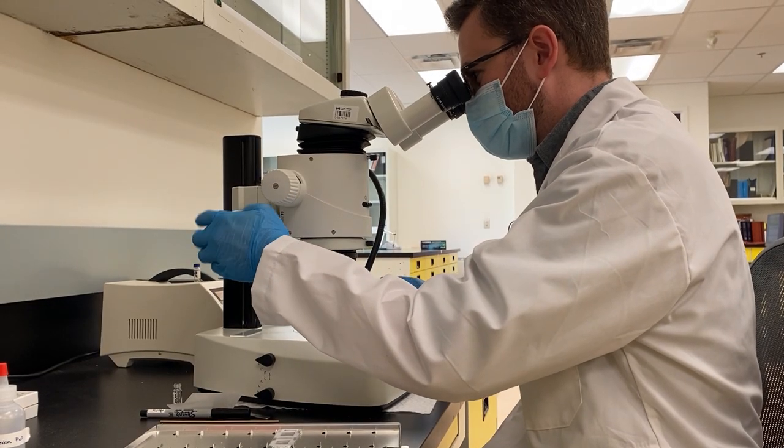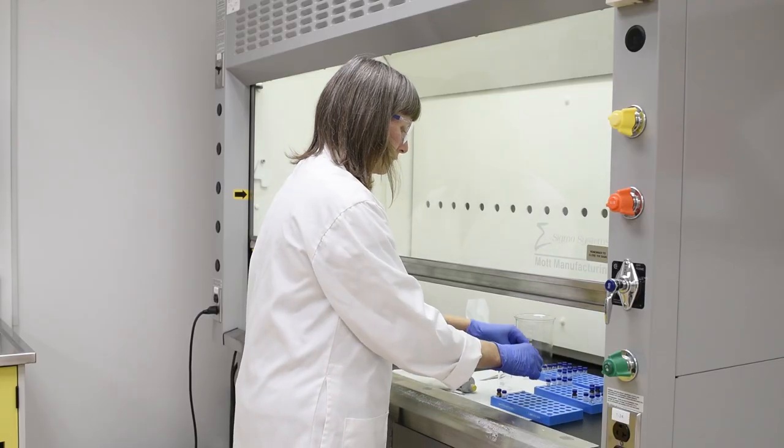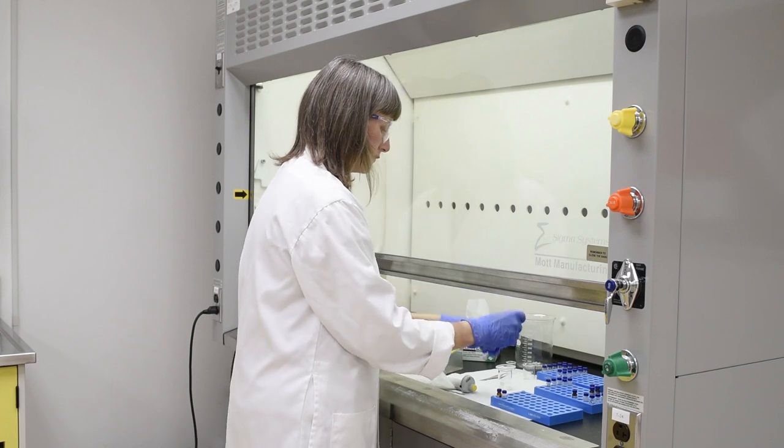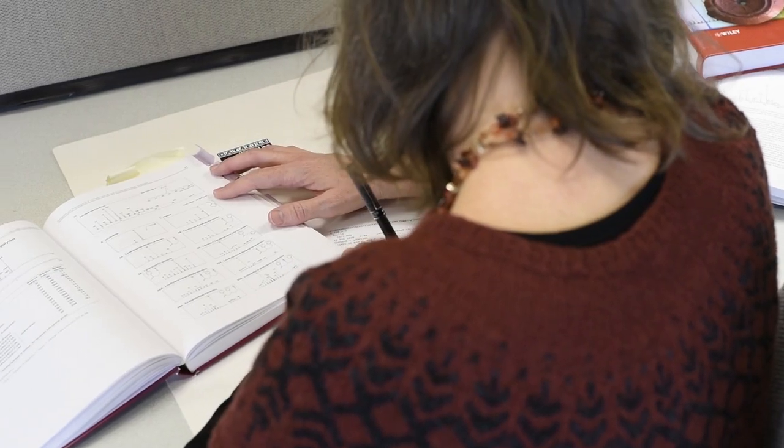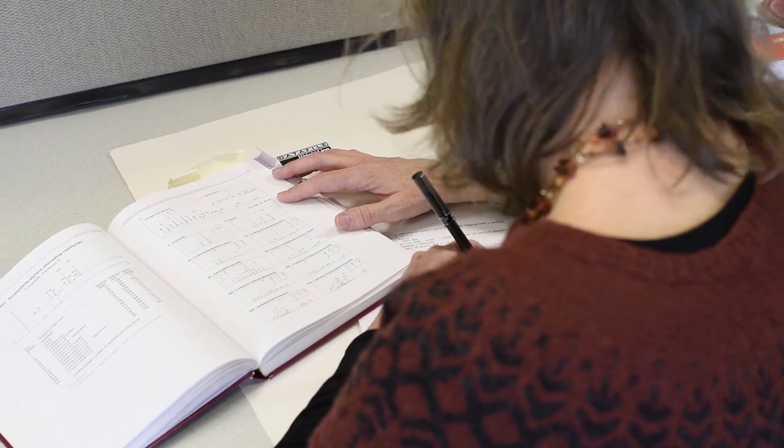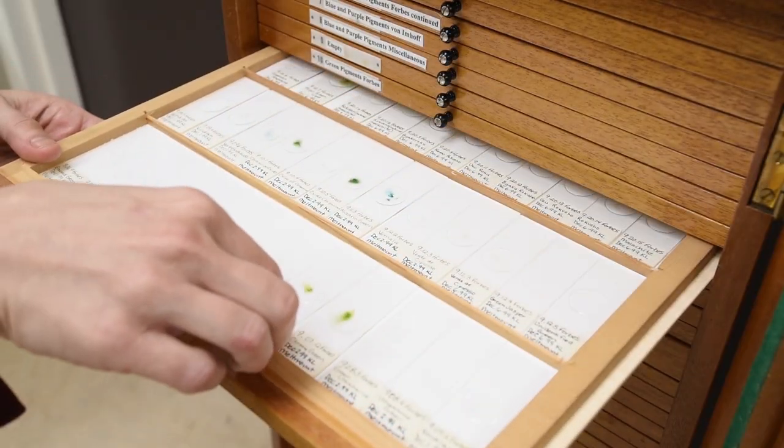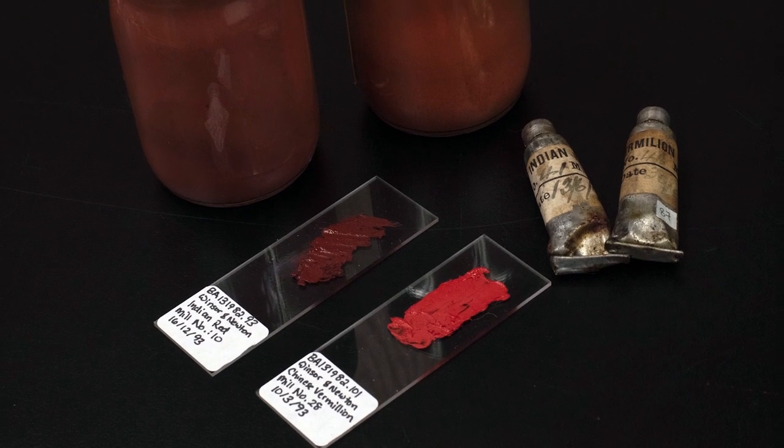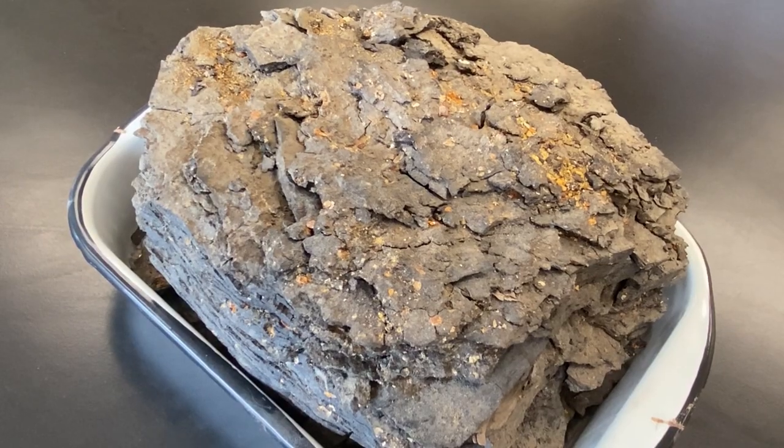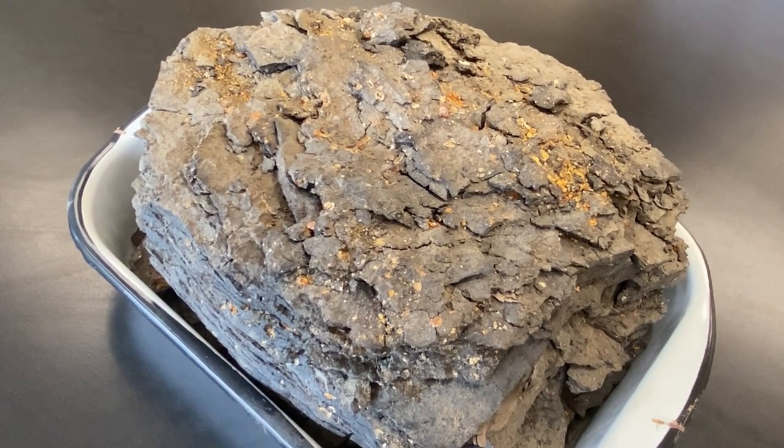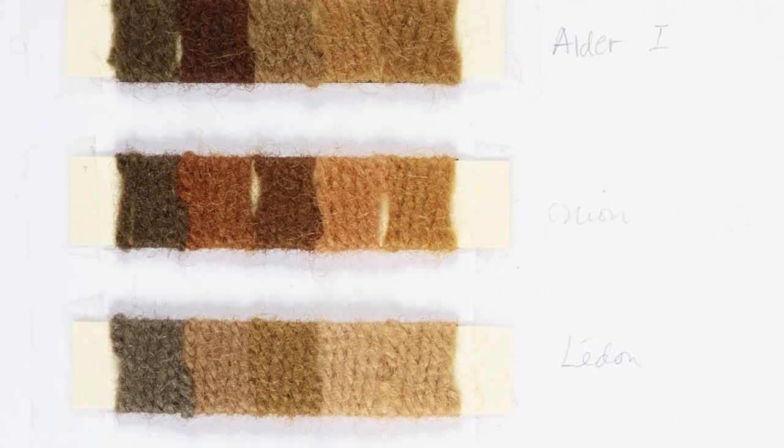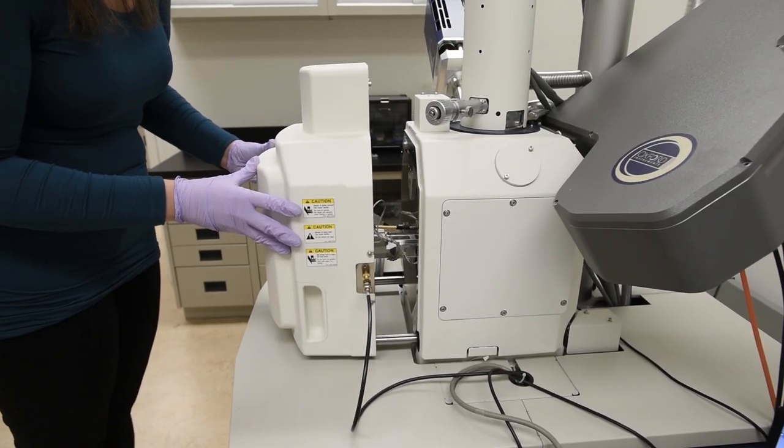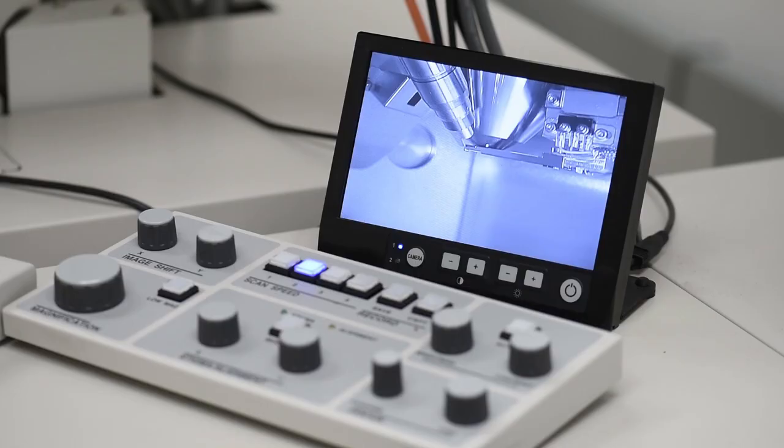From there, we can address more probing questions and begin to piece together the life history of an object. We can examine how an item was made or used. We have experience in the analysis of artists' materials and techniques, archaeological objects and residues, modern materials and textile dyes. We also examine conservation materials for their suitability in treatments.